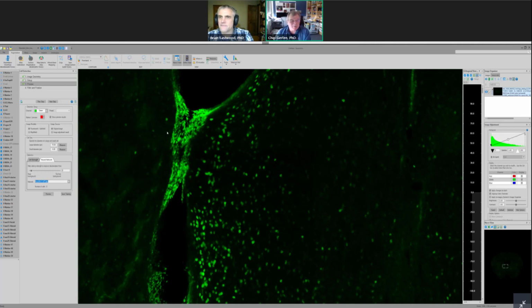Okay, so then we went through and obtained a lot of training data from areas that had artifacts. What we did was to go through and say, okay, these artifacts are not the cells that we're looking for. And as Brian says, this is an iterative process, so we went through and generated a new one. And now you can see that this did a much better job of identifying the FOS positive neurons and did not detect objects in the areas that are negative. Also, we can see that there was a lot of pseudo artifactual stuff on the other side that we had detected before and is no longer detected.